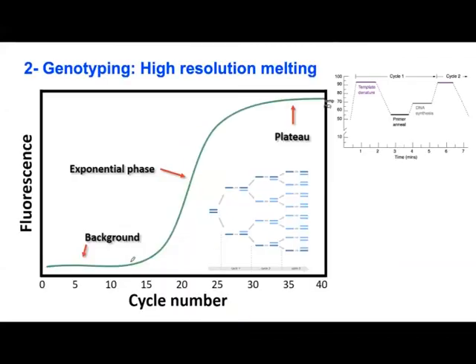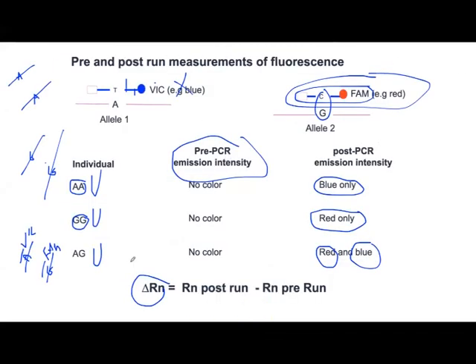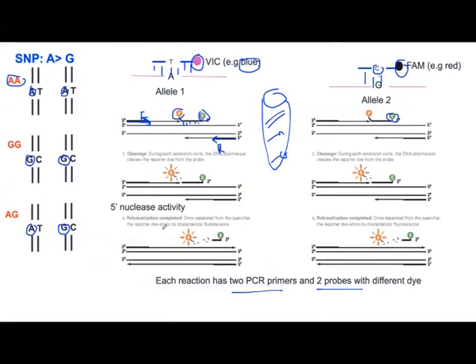But if somebody says, okay, Doctor, the probes are expensive. Yeah, because probes, I mean, the price in Oman is higher than outside. I think it costs around 150 Omani Riyal if you want to buy a probe. But remember that this probe can be run for thousands of samples. So if you have a project that runs many samples, it becomes cheap for you.